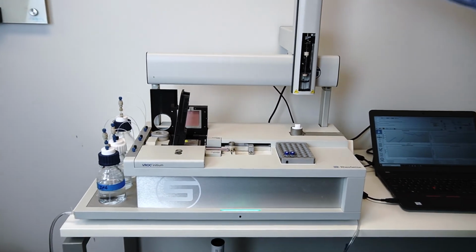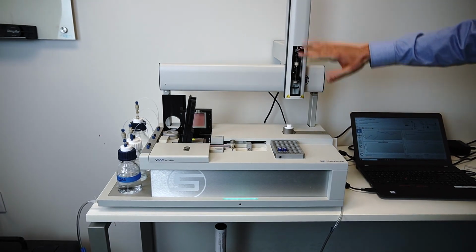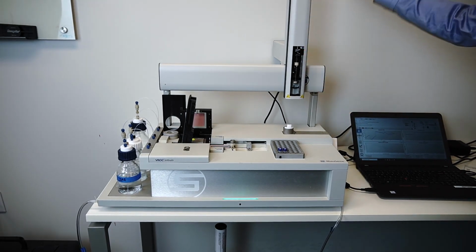So now the auto sampler has finished cleaning and is going to be in rest here until we move on to the next sample.